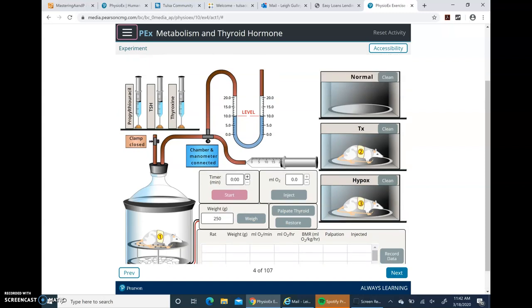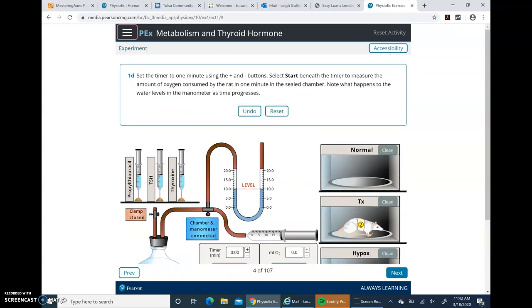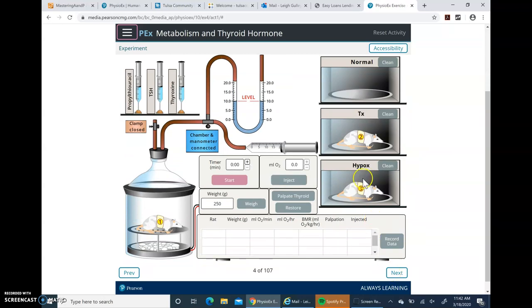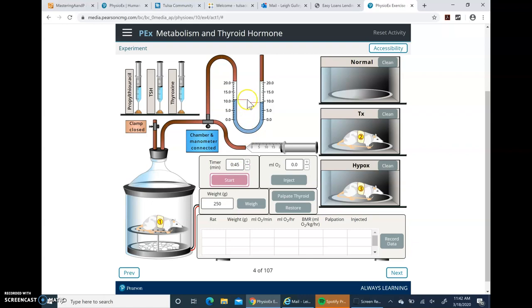Set the timer to one minute using the plus and minus buttons, then select Start beneath the timer to measure the amount of oxygen consumed by the rat in one minute. Note what happens to the water levels in the manometer as time progresses — this is the manometer here, and the blue is the water. I'm clicking the plus button to one minute. Click Start. Look at what's happening at the manometer — the rat is drawing air in, and you can see it's drawing that water up the left arm of the manometer. Then click Next.